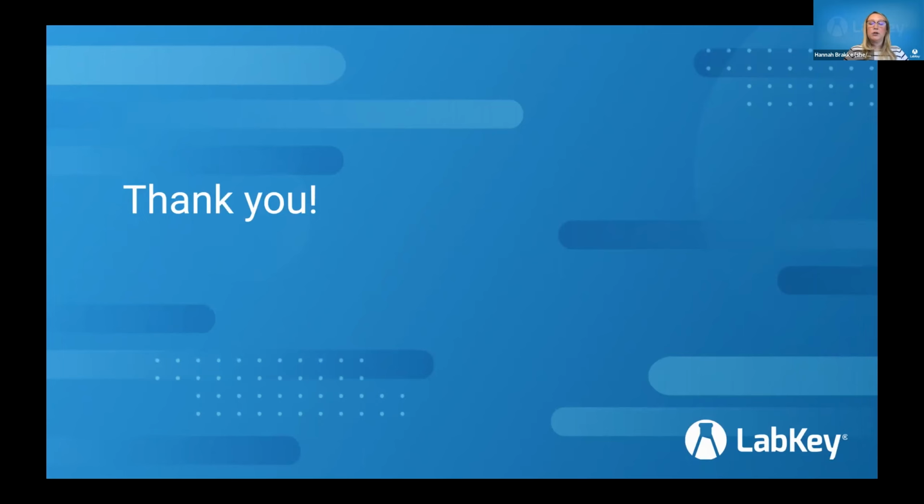So by moving from a spreadsheet-based system into a tool like Sample Manager, you have better connectivity when you are not in the lab. You have the ability to validate your data entry as well as ensure that folks have the right access. And then we're also providing you with a lot of other things that Excel is not able to provide, like that data-connected ELN, like managing workflows or requests within our workflow management system. So there's lots of reasons I'd encourage you to schedule a demo with me and we can talk about it.